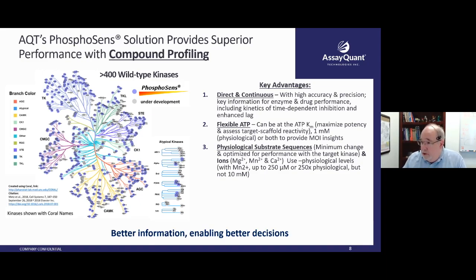On the other hand, if you're interested in the actual enzymology, biochemistry of the target interaction there, then you will get the best range of activities, the best focus on that if you do it at Km. All right. And so if you're relatively early in the process, most enzymologists will recommend, and many will insist, that you do it at Km to cast the widest net possible.